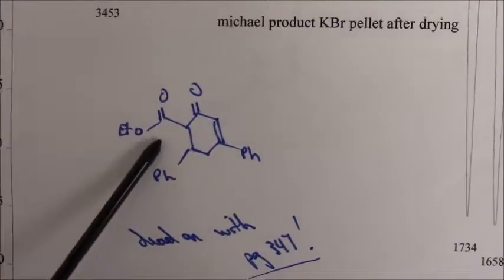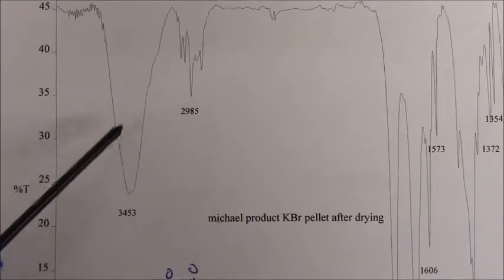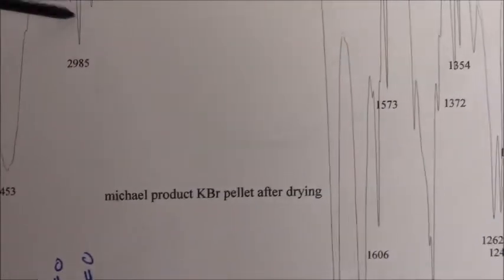The product. So the product, looking like that. So the IR that I took, clearly this peak here, you really have to wonder, it's not part of this product. It could be leftover, for instance, ethanol, maybe, or moisture. But I would not label this peak. If you had to, I would say, if yours looked like this, I would say ethanol, perhaps, or water.